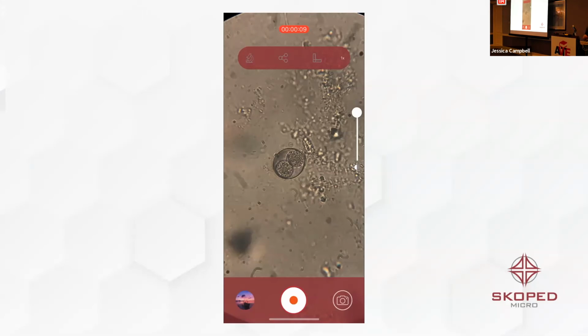All right, so we're looking at, like she said, I think she's named him Dexter. I'm the only person here who smuggled demodectic mange from Oklahoma. And so what we've got here is him. We can use this microscope just like you would any microscope. We can scan around. I can use my digital zoom to zoom in. I touch up here. So you're seeing my setup here. I'm on 10X on my lower objective, I'm on 15 on my eyepiece. There's my calibration factor for this microscope, and then I just drop on my micrometer.